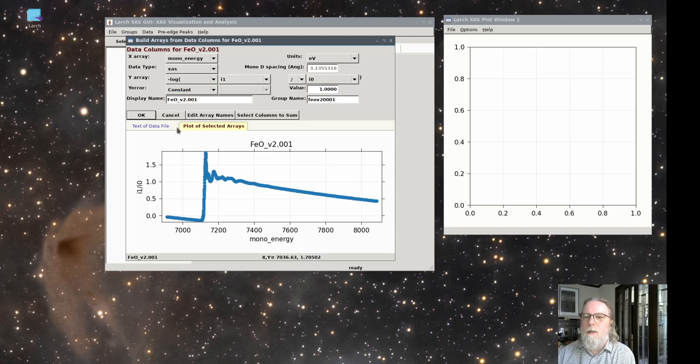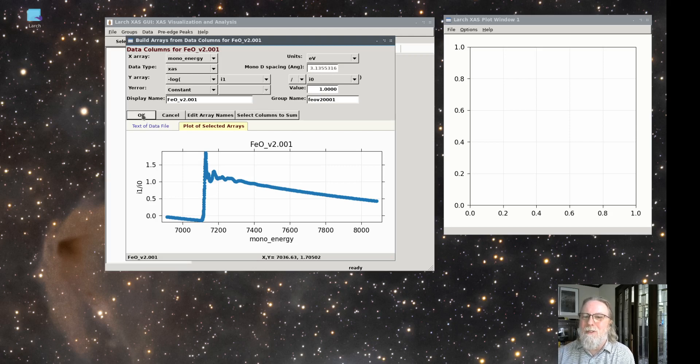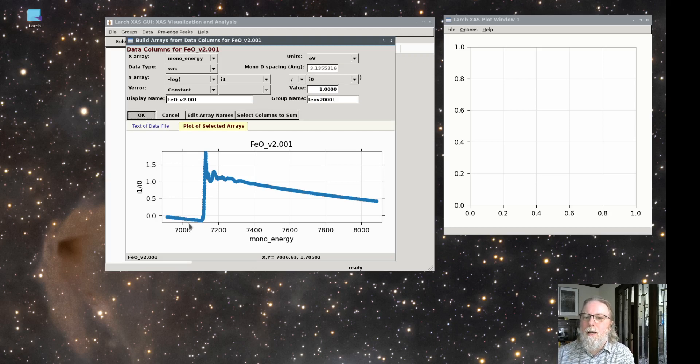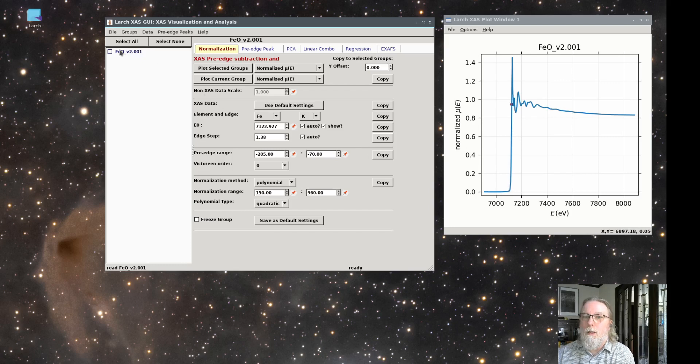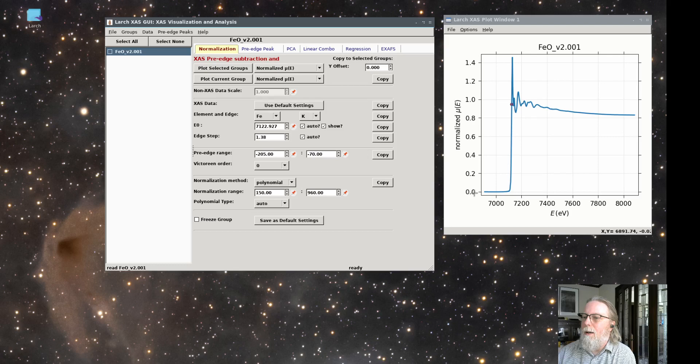And for transmission data, it's vital that you do take the log. So it's important to know how the data was measured when you're importing it. So I'll say okay, and we'll get this plot, and it defaults to show normalized XFS data. Again, it goes from about zero to close to one.